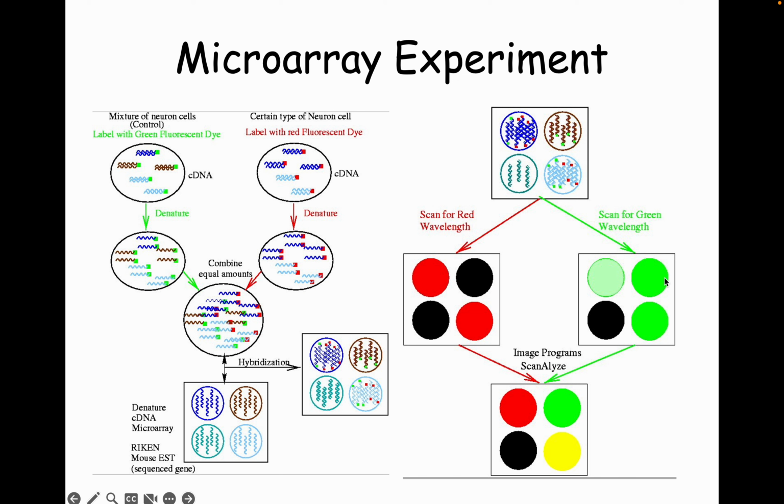Once you scan for different colors, you could combine them, and in most modern papers, the style guides recommend that you don't use red and green. So if you're saying, what are all the gray dots on here? These guys are red over here. These guys are green, and when they combine them, that one turns yellow because it is both red and green. So there you go. Amazing. But yeah, you can combine or you can break down the images into their different color components of your microarray.